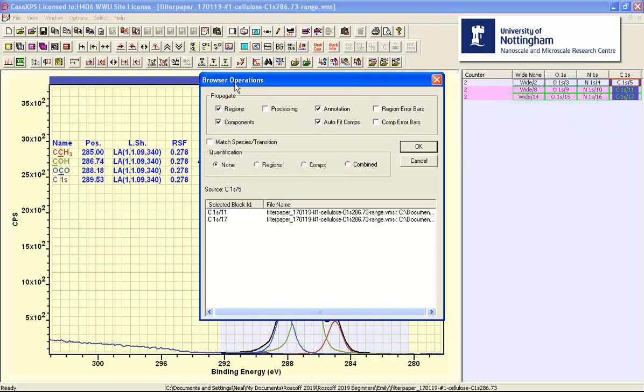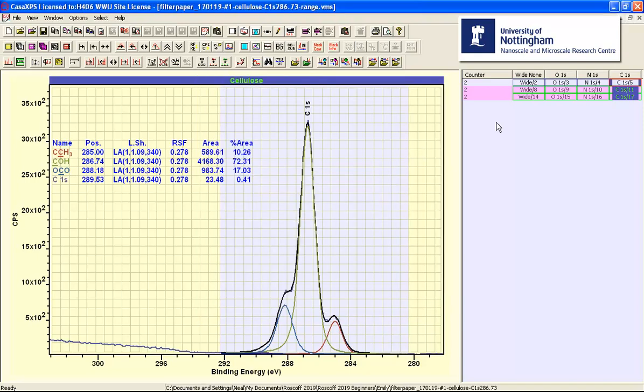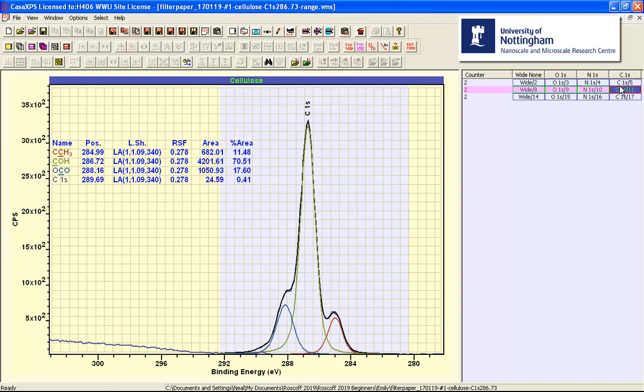So once we've prepared this browser operations dialog window, we say OK. The action occurs, we have a peak model that is now based on the original peak model in the first of these carbon-1s VAMAS blocks. And the same will apply to the oxygen.